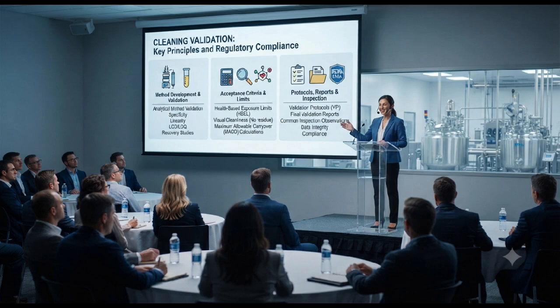In the next part, we will cover analytical method validation for cleaning validation, acceptance criteria such as MACO, visual cleanness, health-based exposure limits, validation protocols, report preparation, and the most common inspection observations from regulatory agencies.